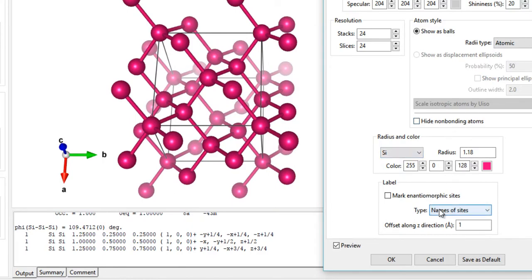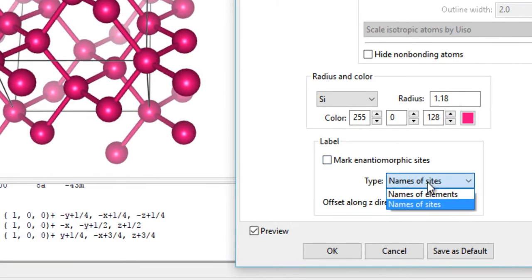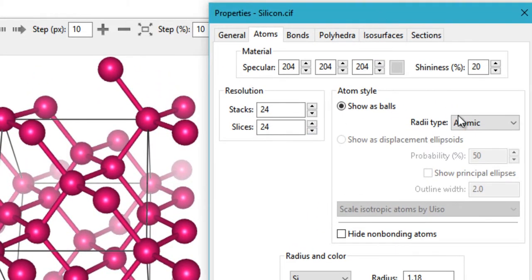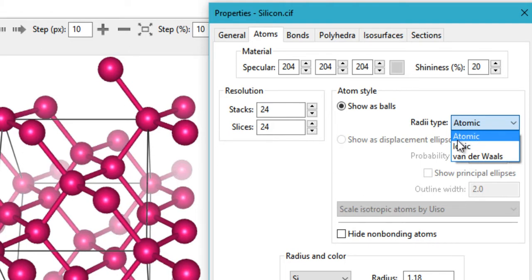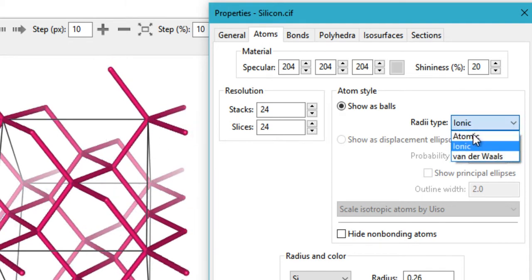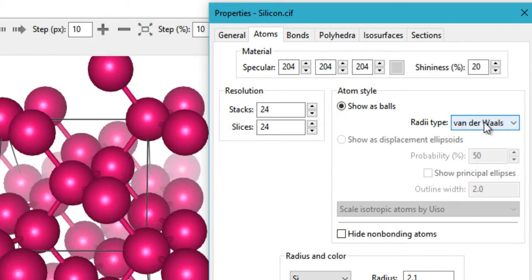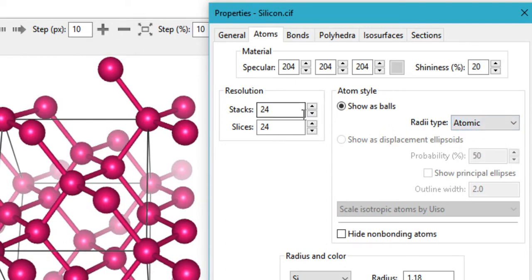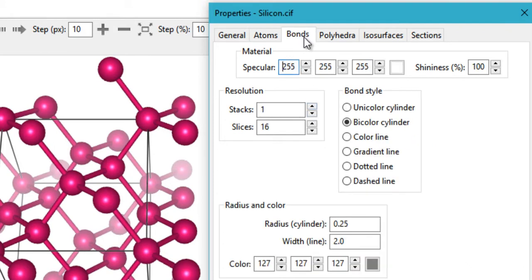There's an important option for the type of radius: you can choose atomic radii, ionic radii, or van der Waals radii. I usually choose atomic. There's also a resolution setting whose effect I'm not entirely certain of.